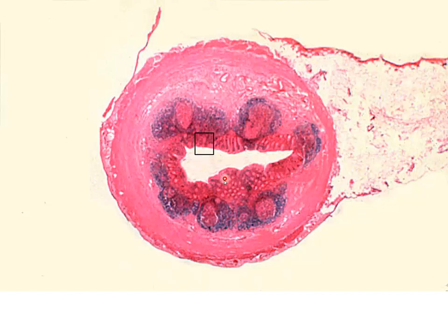You can also see the white spots, which are going to represent some of the crypts with their goblet cells. And so this very small luminal structure is going to point out to you, especially with these lymphoid nodules, that you're looking at the vermiform appendix. This most certainly is not Peyer's patches present in the small intestine. We don't see intestinal villi, and it's not nearly big enough for that.